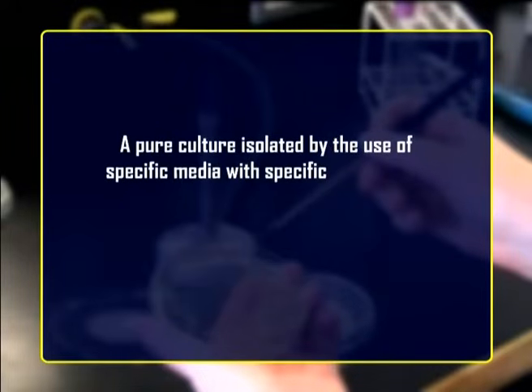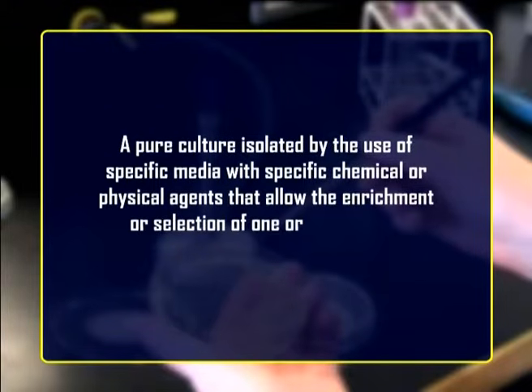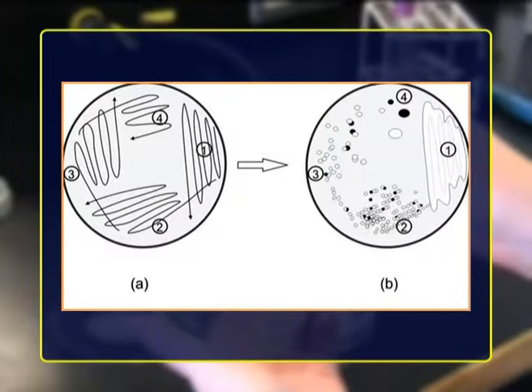There are a number of procedures available for the isolation of pure cultures from mixed populations. A pure culture may be isolated by the use of specific media with specific chemical or physical agents that allow the enrichment or selection of one organism over another. Pure culture involves not only the isolation of individual microorganisms from a mixed population, but also the maintenance of such individuals and their progenies in artificial media where no other microorganism finds its way to grow.